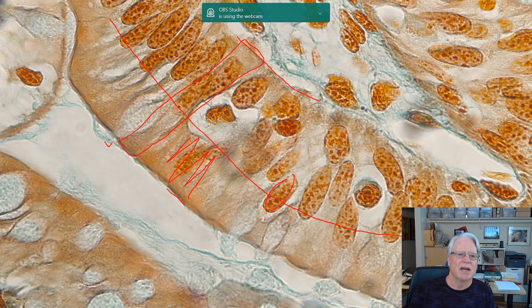of the cell. And this is a nice picture of the mucus. In fact, all of this stuff here, that's mucus. That's been released by these cells and is in the lumen of, this would be the small intestine.